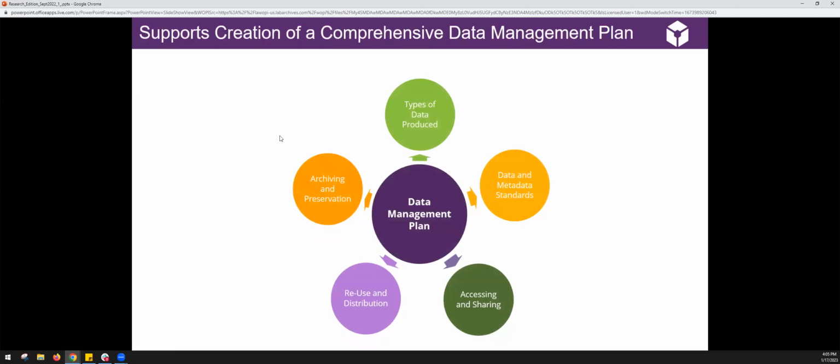We are sitting there saying, hey, what is a data management plan, or what is a data management and sharing plan? It's often a formal document that you and your team create that describes what you do. What types of information do you collect? How do you collect it? How do you name and organize that data? Who in your team has access to it? Can they edit the data? Can they share the data? How do you onboard employees or offboard when people leave? How do you change their access to that data?